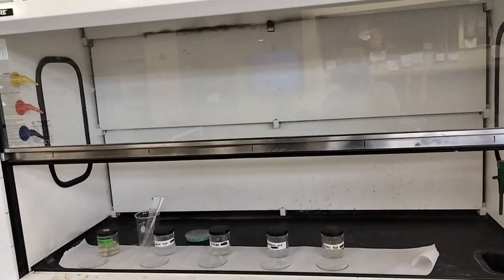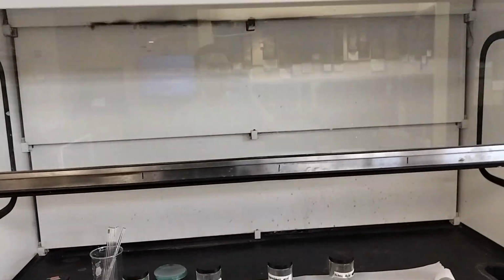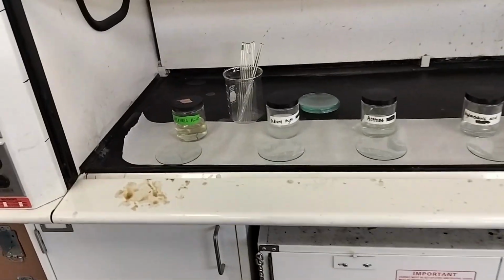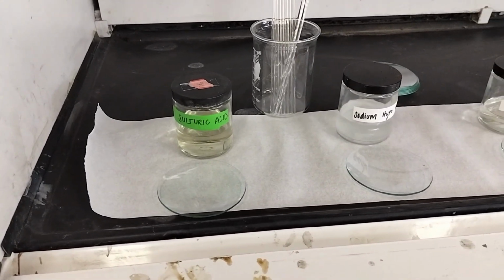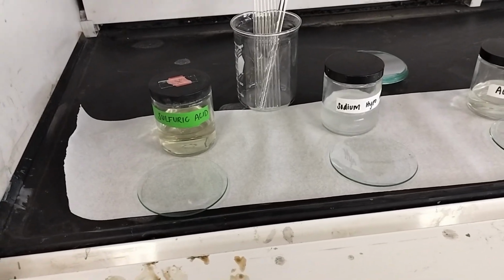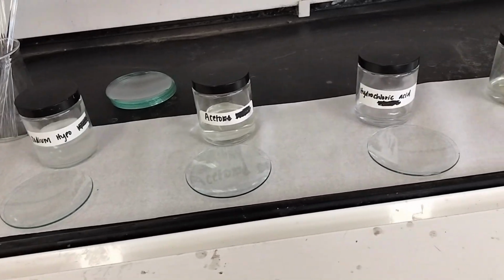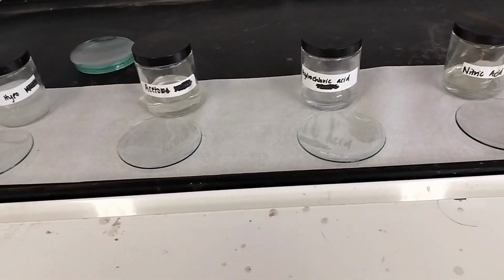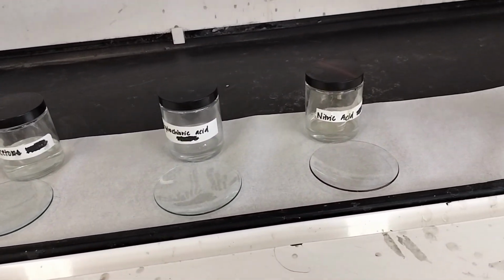Now, let's introduce the chemicals and the fume hood. This is called a fume hood. Since these chemicals are hazardous, we must always perform our test inside the fume hood, not on the regular lab table. Today, we will be using the following chemicals: 70% concentrated sulfuric acid, 5.25% sodium hypochlorite, acetone, hydrochloric acid, and nitric acid.